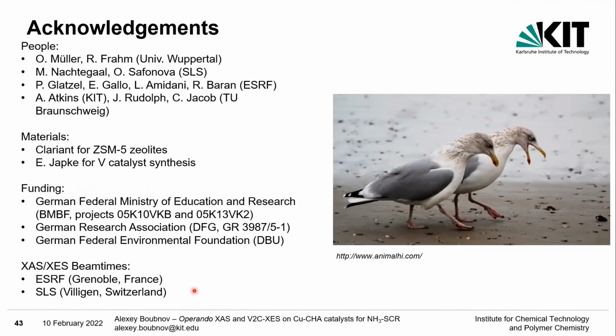Hi there. Fantastic talk. Very ambitious to put vanadium, iron, and copper all in one talk, and very impressive. My question goes back to the vanadium SCR catalysts. Am I right in saying that there's no real correspondence to any specific vanadium oxide? Is it not vanadium 3, 4, or 5, or the geometry is not 3, 4, or 5 from what you were showing there? Have you measured any other model reference compounds to be able to hone in on what exactly the active vanadium species is under reaction conditions?